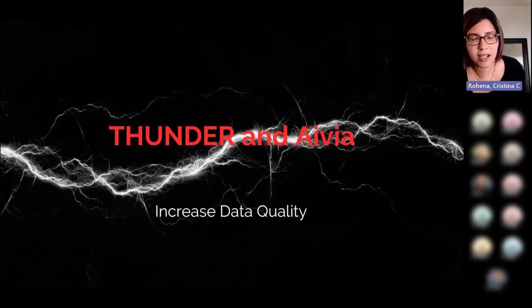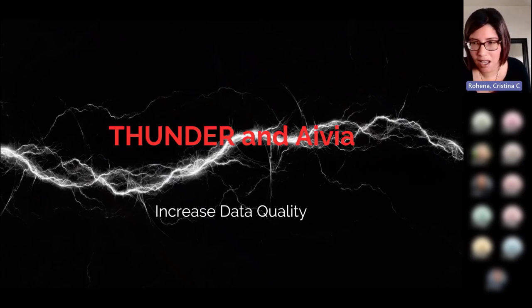Finally, I will speak to you a little bit about Thunder in combination with Aivia and how that can increase your data quality. So Aivia is our AI image analysis software that makes advanced data analysis accessible really for all biologists. Aivia's AI-powered analysis capabilities essentially leverage your expertise as a biologist to really generate robust and reproducible segmentation results. You essentially train your software to segment your data and analyze your data.